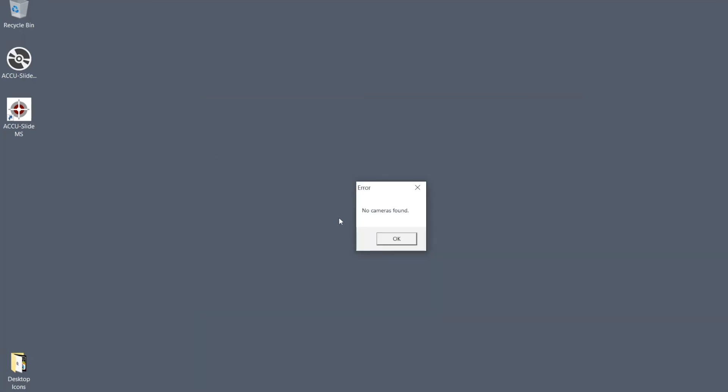If the camera is attached, AccuSlide MS will request the camera license file. This will be addressed in the next segment.